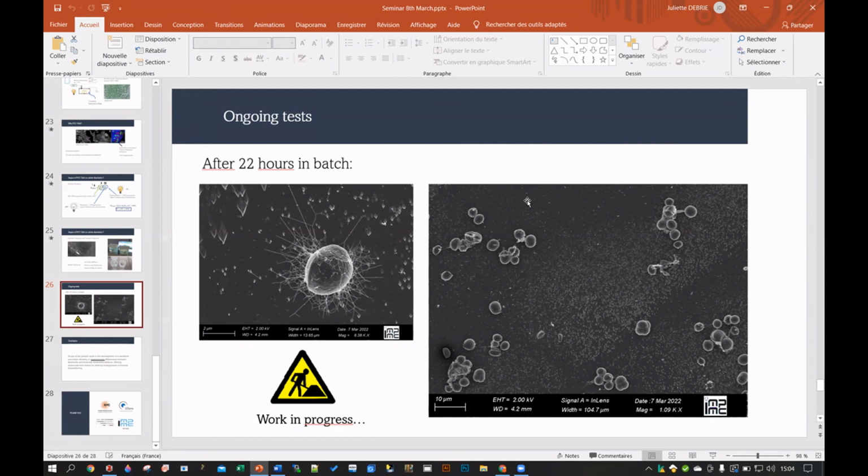I used it, for instance, when you want to analyze mineral fibers in the atmosphere and separate them from organic fibers, which are dominant. It's really very efficient. But you have to be sure that it's not damaging anything on your surface, because if the cold plasma is altering the topography, then you have lost everything. So you would probably need to test things before and after, without organics and with organics. But techniques exist, definitely.